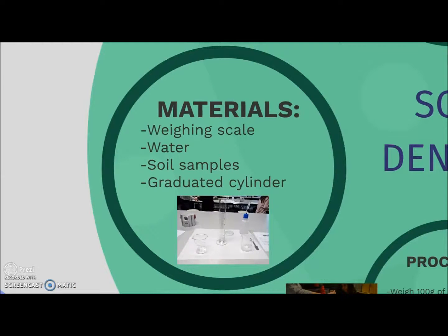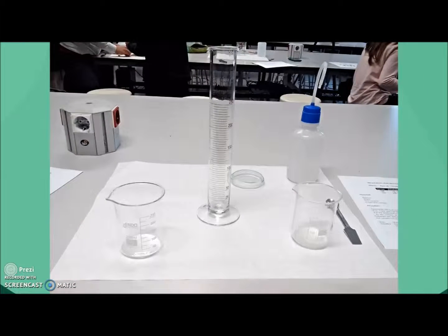Materials. Weighing scale, water, soil samples, and graduated cylinder. This is a picture where we can see all the materials used to make this project.